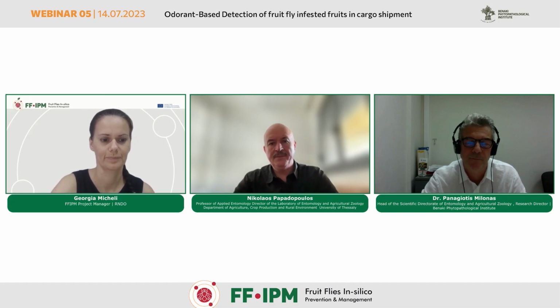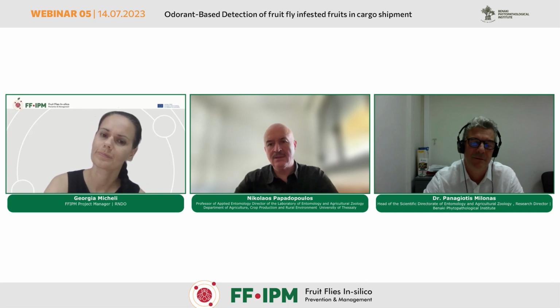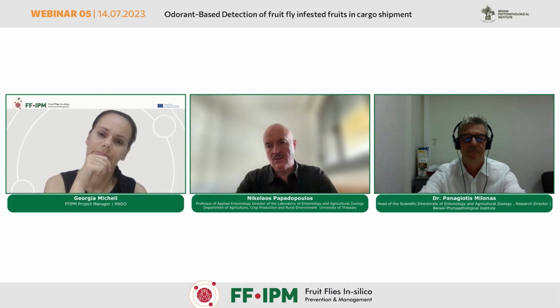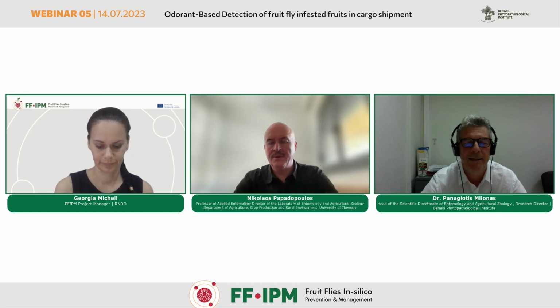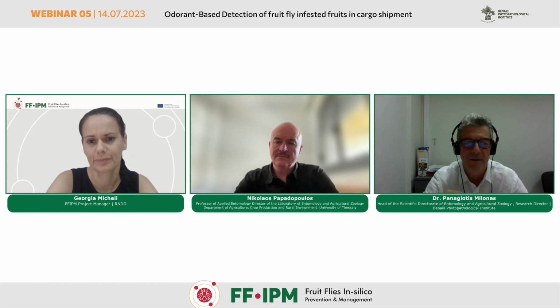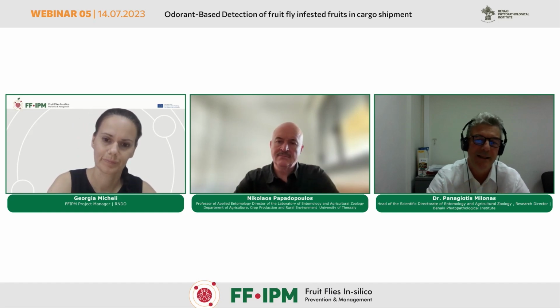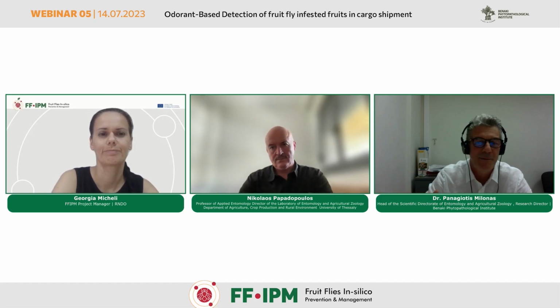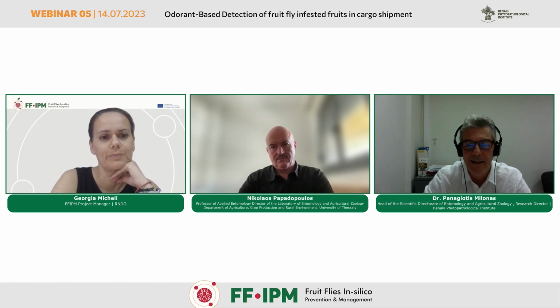Panos, another thing is, what is the temperature dependence of the sensitivity of volatile detection? Is there a specific range of temperatures where you can collect the odors more efficiently, or does this go across broader areas of the spectrum? Well, you saw that we use different temperatures, and the model works better when the fruits are maintained at a lower temperature. But in practice, the inspection will be done in a working environment, let's say 20 or 25 degrees, in an inspection room, as I imagine. And there, I don't see much of a problem with the temperature.